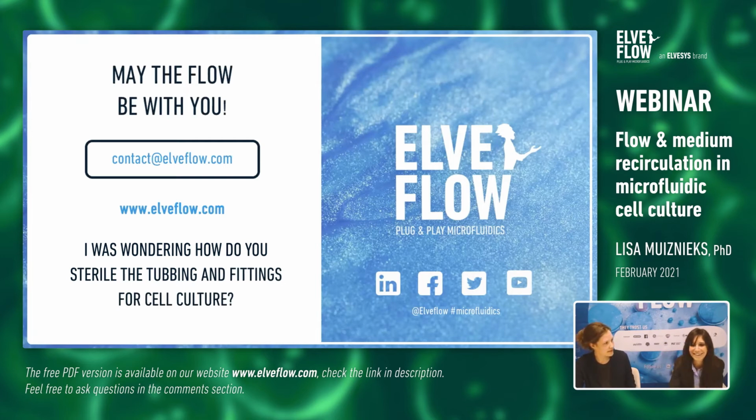Yeah, I can answer as well. Our suggestion here is to replace. First of all, for every experiment that you do, the tubing is considered really a consumable, so you can replace the tubing.